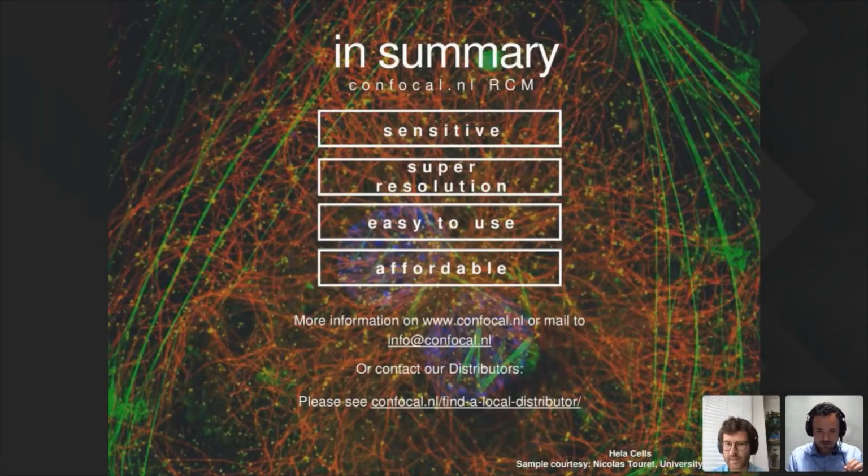Beside that, the calculations are what you would do regularly on a microscope. It will give you 43 microns at 100x. One thing to mention is the Re-scan actually decreased the field of view by a factor of 1.5 by increasing the resolution. So 43 micron with a 100x, 220 micron with a 20x. These are numbers to keep in mind.